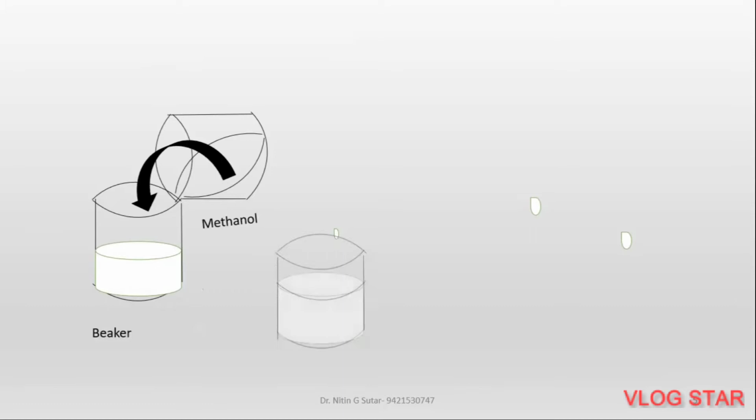After stirring, immerse the glass rod into it. Then remove the glass rod from the beaker. One drop will form on the glass rod, and the drop is drained into the beaker. Likewise, again dip the glass rod and remove it.